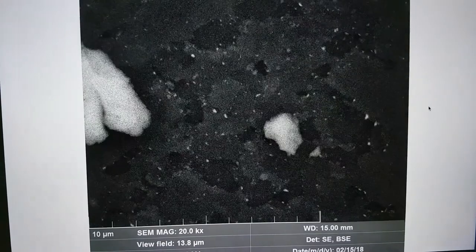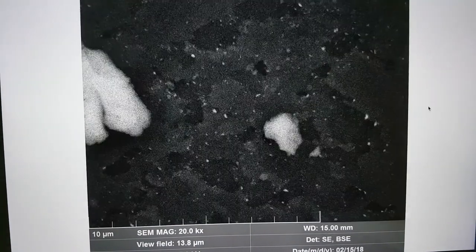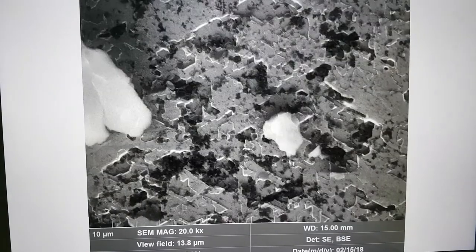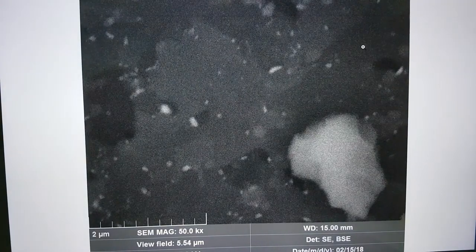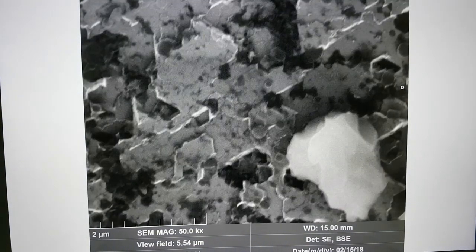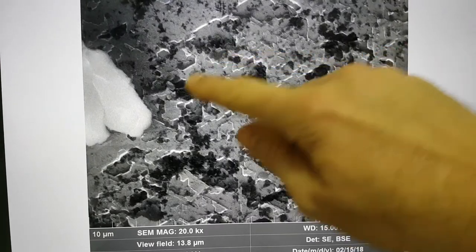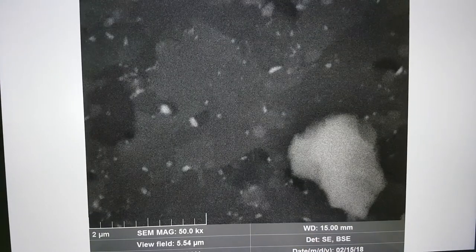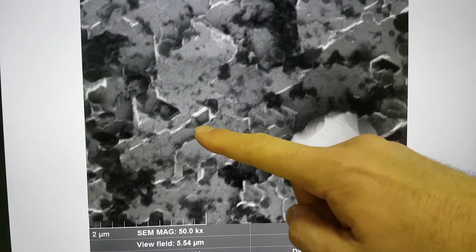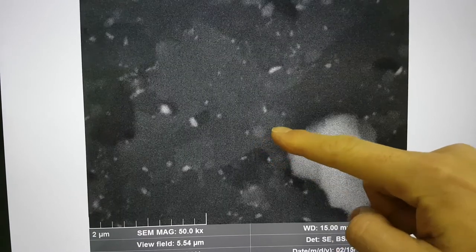We've got one eating sort of up this way rather than down. Then you have these blobs which they're not very different in terms of their color, these round blobs here. We're going to zoom in a little bit closer. Same kind of thing going on here. If you notice this blob here, we're taking a zoom in on this area. You can see this cavity here has been mined out.